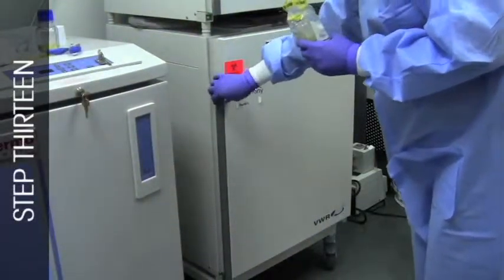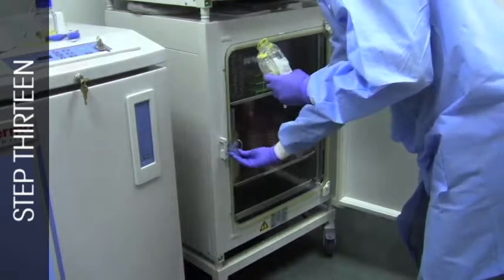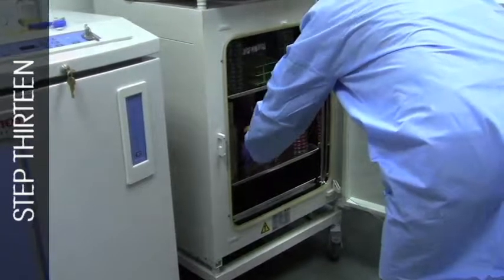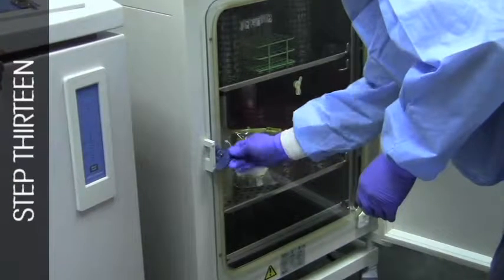Incubate the samples at 20 to 25 or 30 to 35 degrees Celsius for a minimum of 14 days. If two temperatures are used for incubation, incubate the samples for at least 7 days at each temperature.